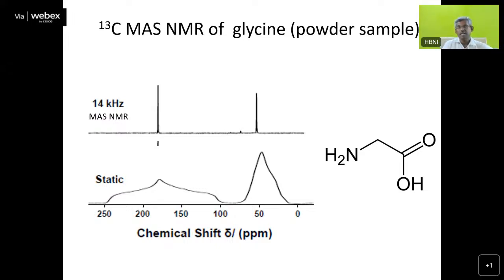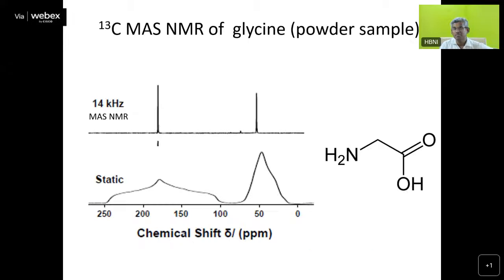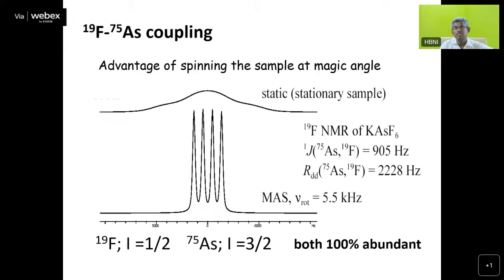That way we can put. Otherwise, with respect to acetone also we can, since a methyl group is there, with respect to TMS. Anything you can put as a solution, anything you can refer to. Correct. So you can compare with the solution state. Yes, solution state actually. Okay. This decoupling part I will come to with respect to cross polarization.